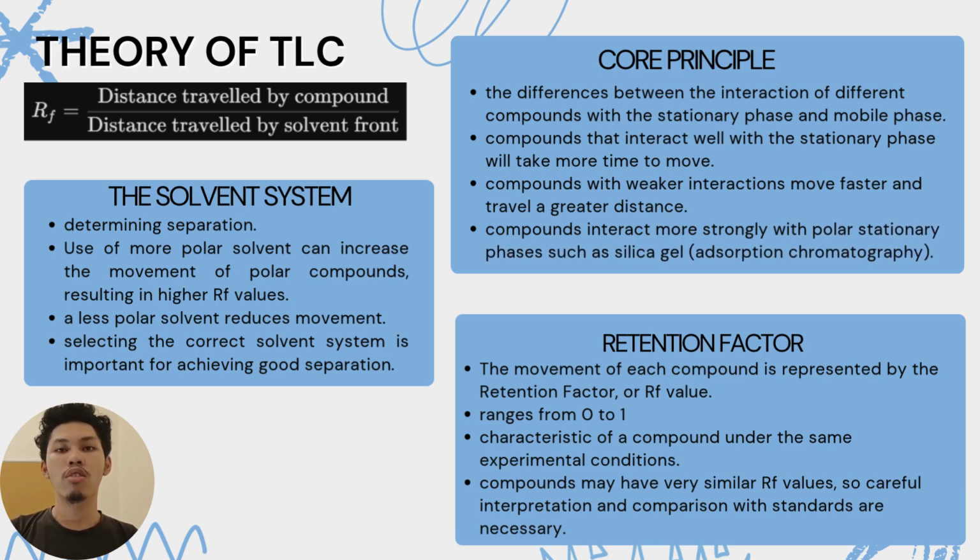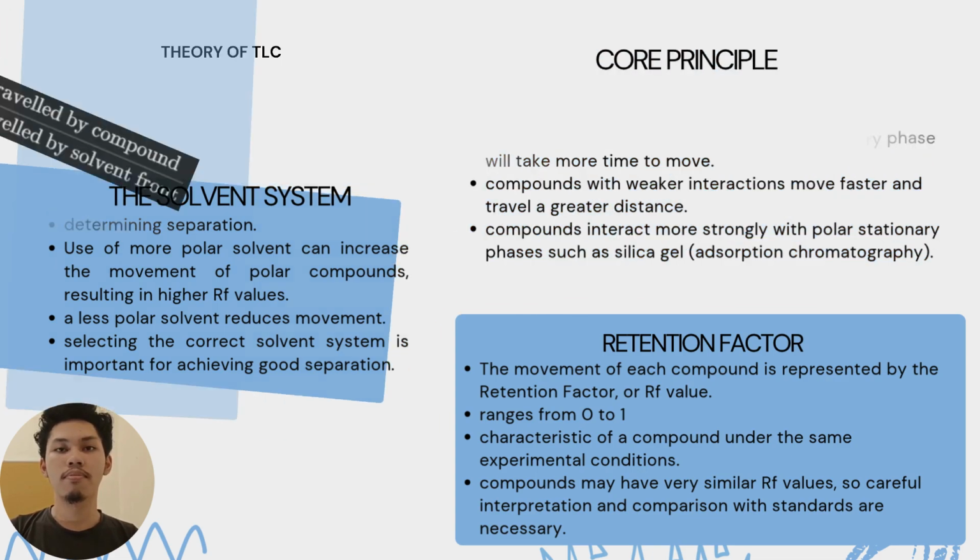Selecting the correct solvent is important to achieve a good separation. The movement of each compound is represented by the Rf, or retention factor. It ranges from 0 to 1, and that also means that some compounds may have similar Rf values, so comparison with standards is actually necessary.